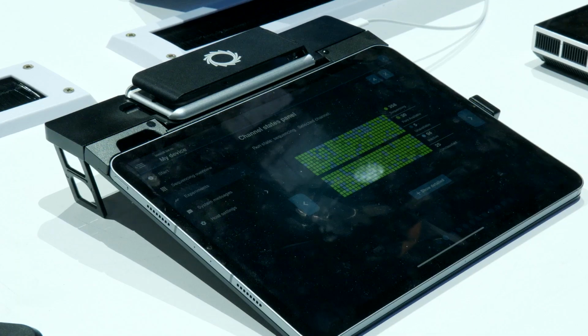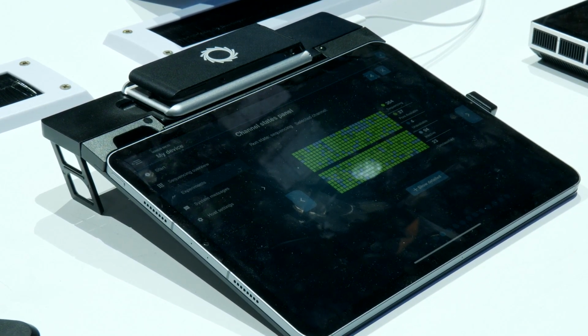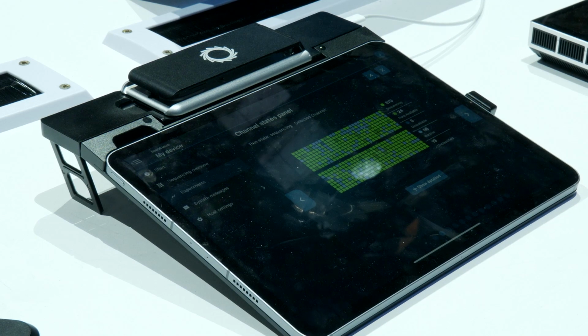So today we're going to focus on the MinION flow cells and the devices that use them. I'm sure most of you have seen and or touched the new MinION Mark 1D and its customized iPad case. So this setup is both portable and powerful, and it can enable the analysis of both known and unknown samples.